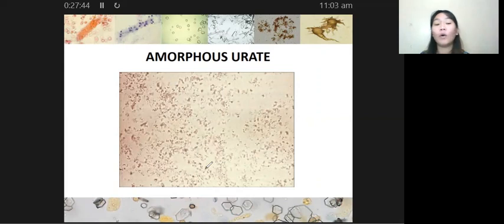Okay, so if I'm not mistaken, nabanggit niya na in order to differentiate your amorphous urate from your bacteria, yung bacteria natin ay gumagalaw. Kasi sometimes medyo parehas sila ng shape ng morphology, okay? And so, ang basis natin doon ay yung movement ng ating bacteria. So, of course, si amorphous urate, hindi siya gumagalaw. Si bacteria, gumagalaw po sila. Okay? Ang cute nila, nagtatumbling-tumbling doon sa ating urine sample. Alright? So, that is for your amorphous urate.